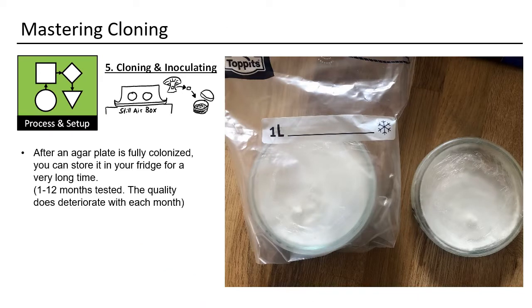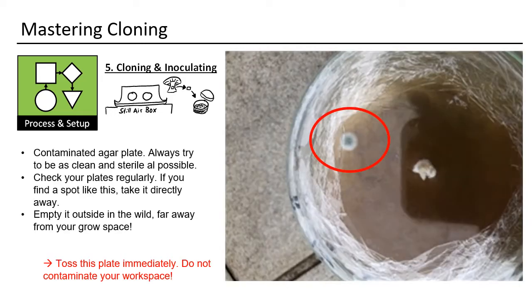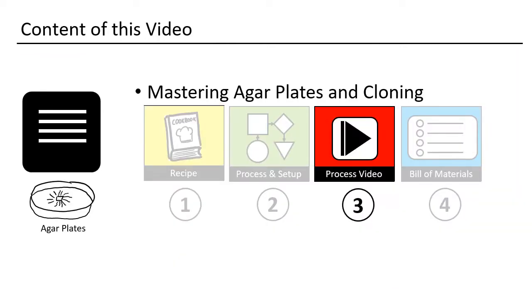After full colonization is achieved by the mycelium, you can use the dish. I normally store it in the fridge for when I need them. If you do not take enough agar ice cubes, you will have a not so good result. Here I only took one. If you have contamination, toss the plate immediately. Do not tolerate any contamination. In the upcoming video I will show you the cloning process.